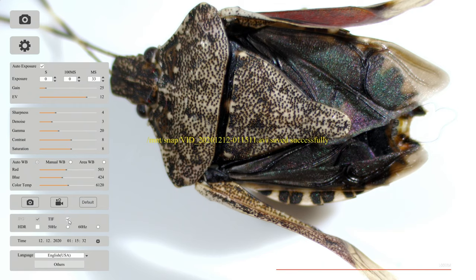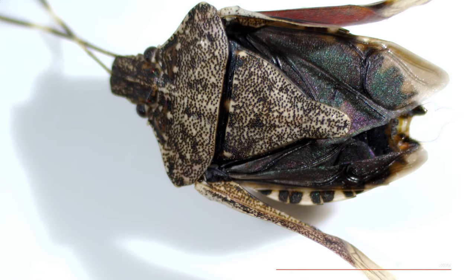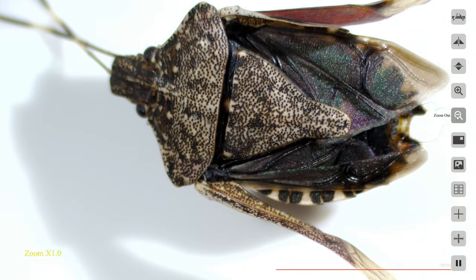We also have the option to save as TIFF, which was not present in the previous HD camera. My right menu has my calibration settings. I also have a vertical and a horizontal mirror, so I can have the correct orientation on the screen that I have through my microscope. There's also a digital zoom — so if I'm in between objectives or I've reached the end of the zoom range on my stereo microscope, the digital zoom can assist.